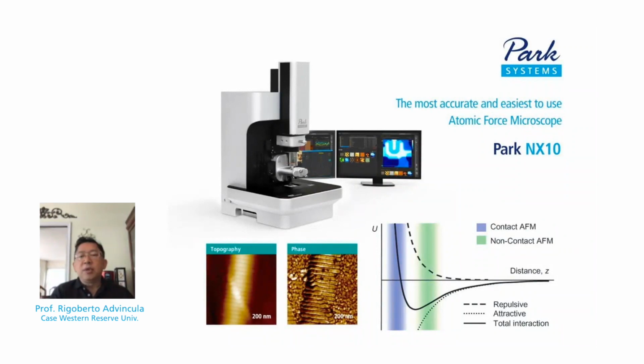So in a non-contact mode, we are able to do away with some of these forces and thus get a better picture of the total interaction.